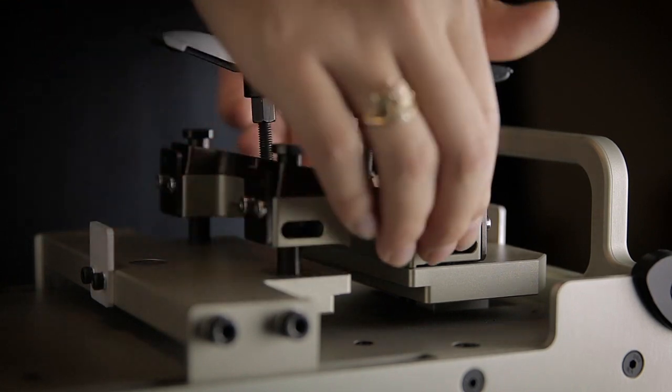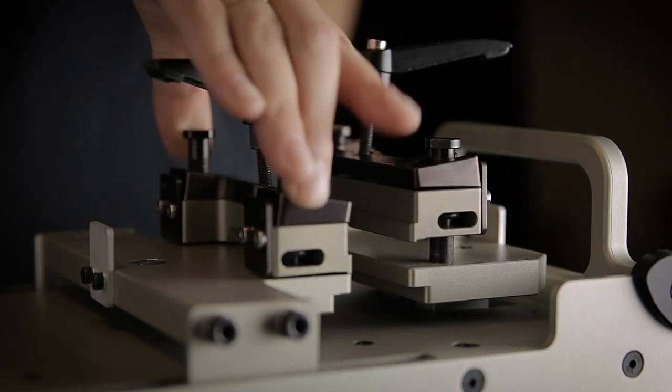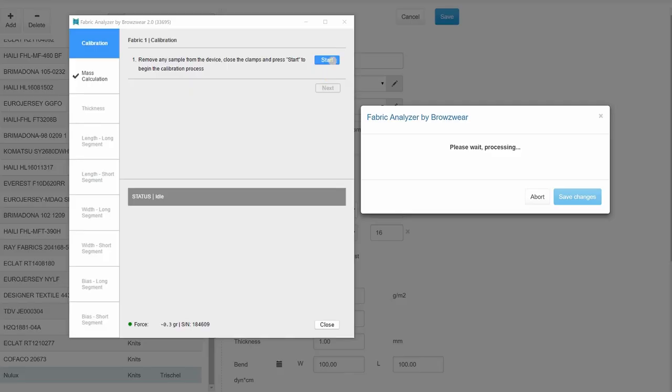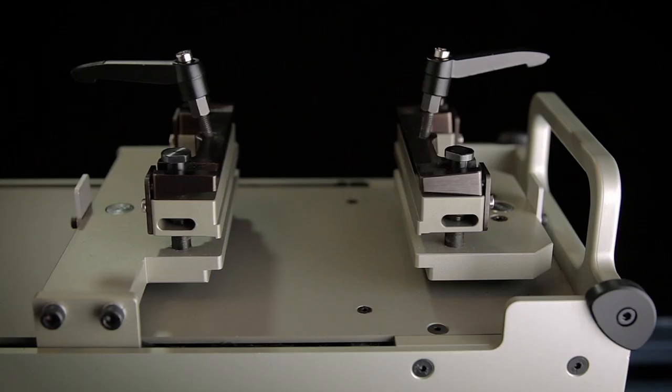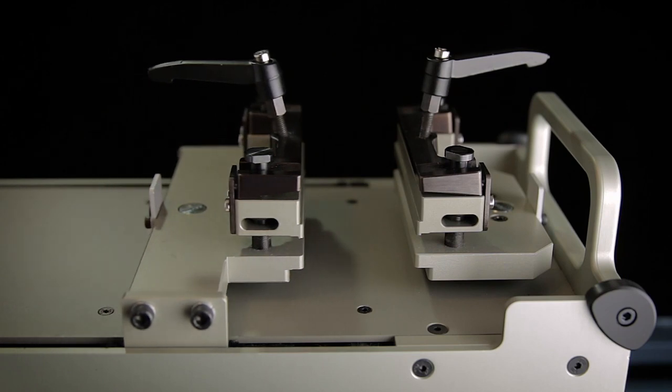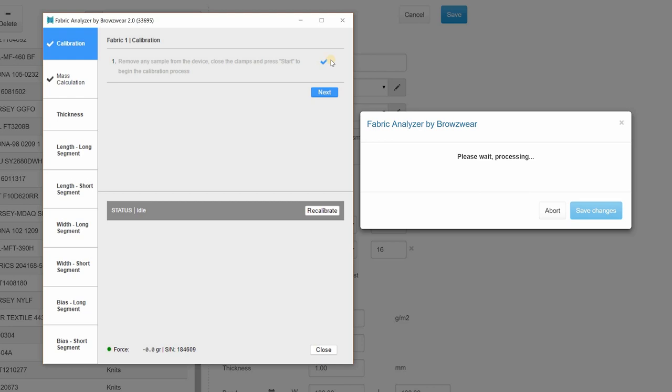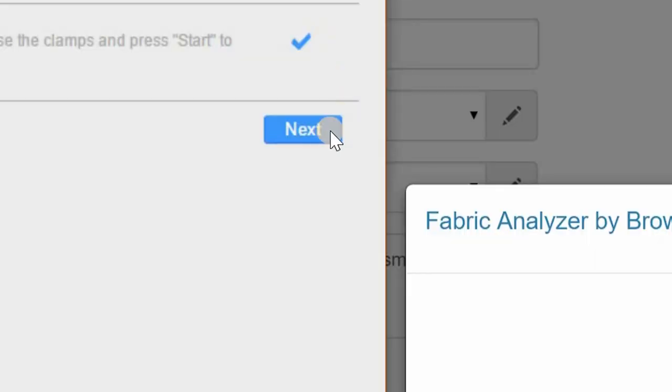Make sure the clamps are either both up or both down, and there's nothing obstructing the path of the movable arm on the FAB. To calibrate, hit Start. The process will begin. The movable arm will move towards the fixed arm and back and forth a few times. You'll know the process is complete when the next button has appeared in the Fabric Analyzer window on your screen.